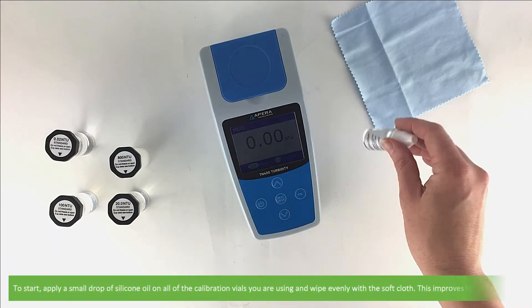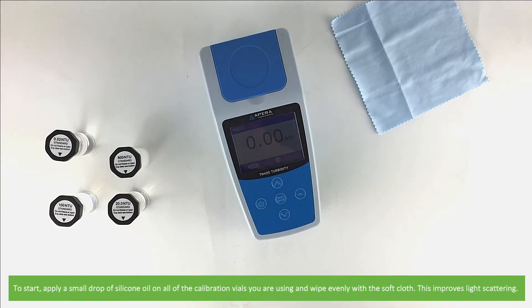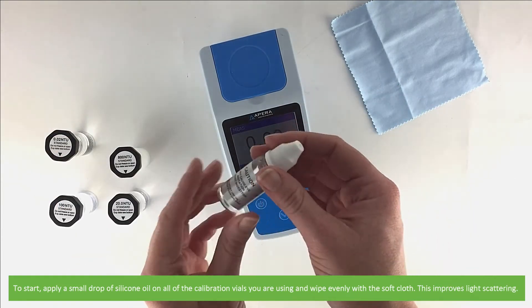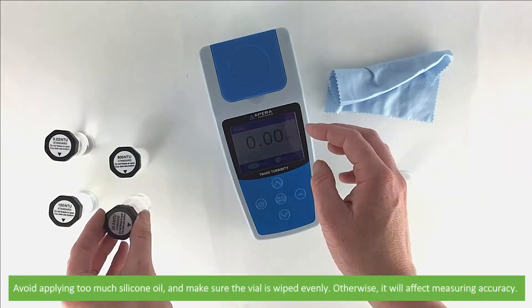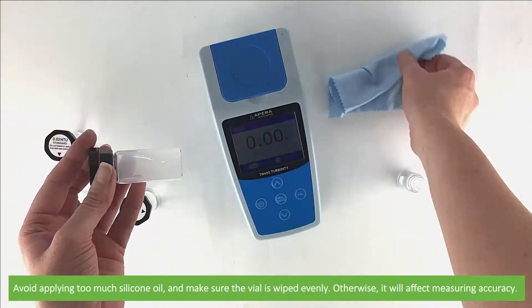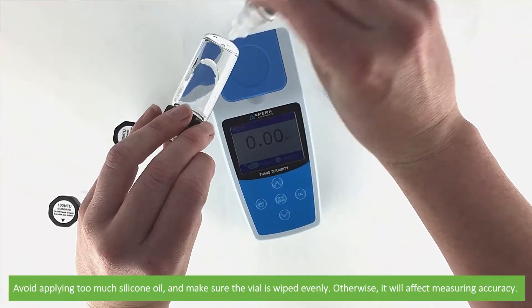To start, apply a small drop of silicon oil on all of the calibration vials and wipe evenly using the soft cloth. This improves the light scattering. Avoid applying too much silicon oil and make sure the vial is wiped evenly, otherwise it will affect measuring accuracy.